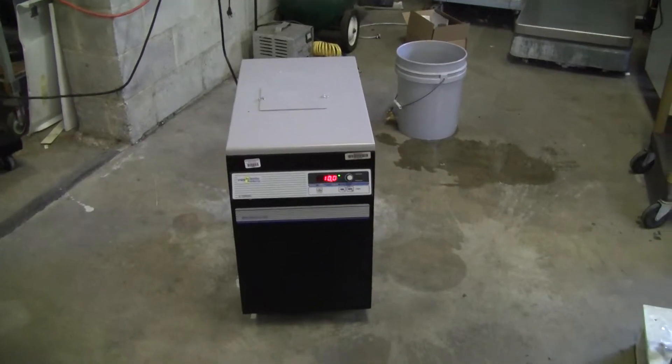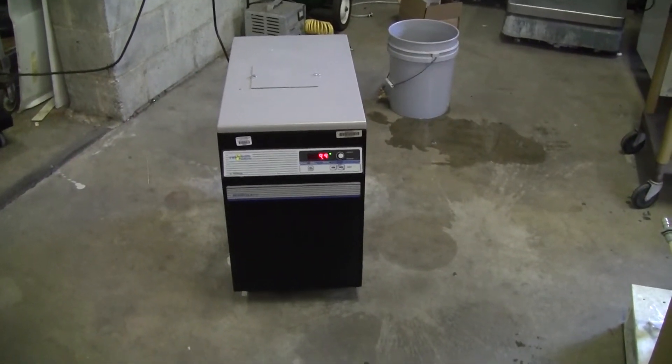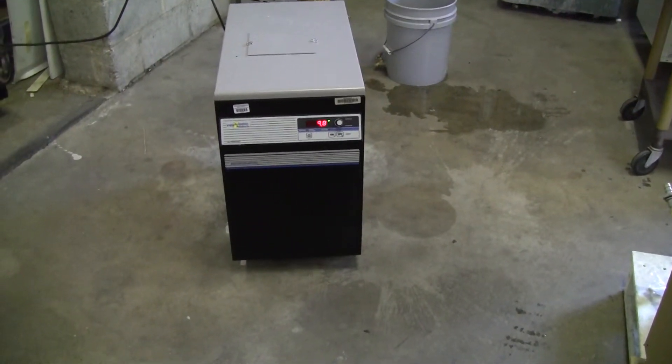It's got a 3 quarter horsepower compressor and a temperature range of negative 15 to 40 degrees C. The flow rate is 4.3 gallons per minute.